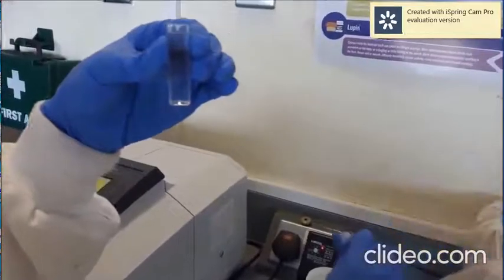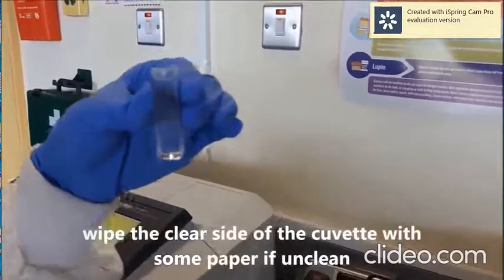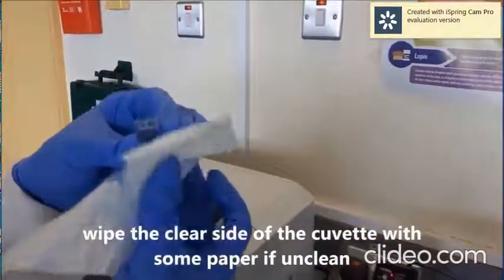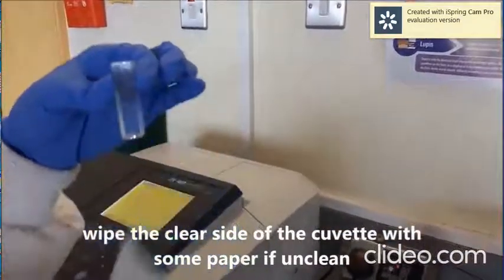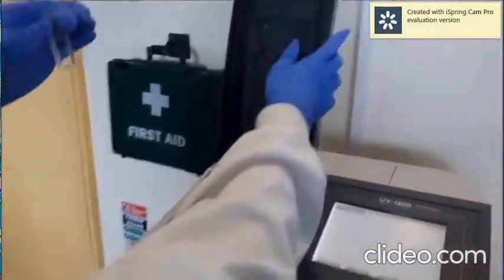Now this particular cuvette has to be slowly transferred to this area. Here you will find that there are two sides of the cuvette, one is hazy, another is transparent.